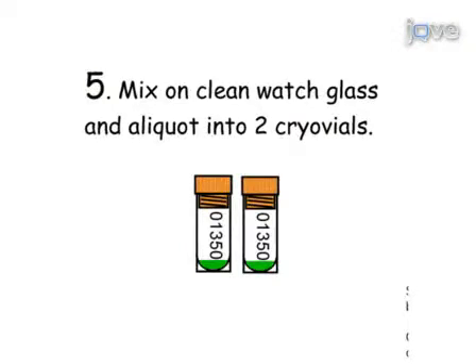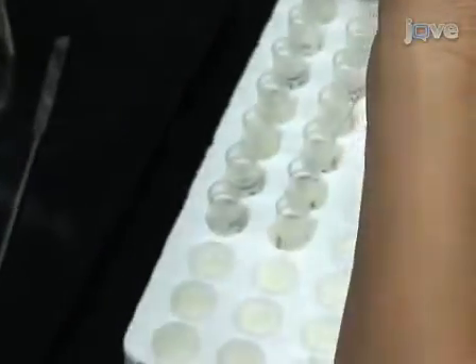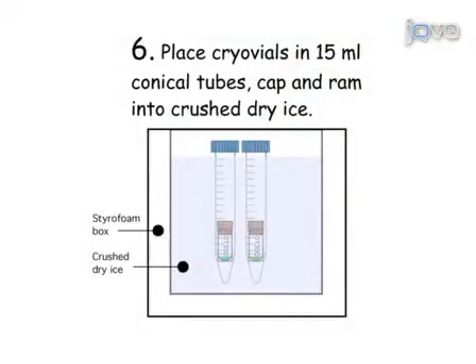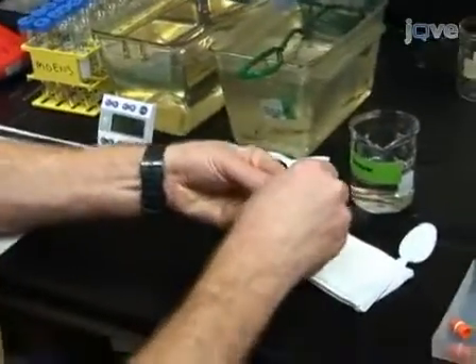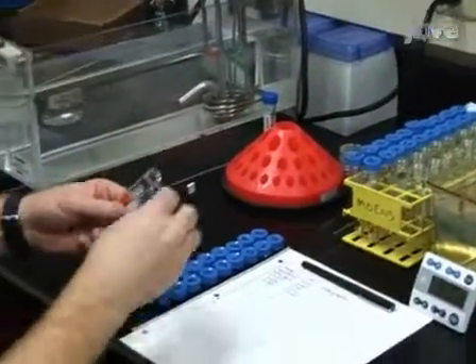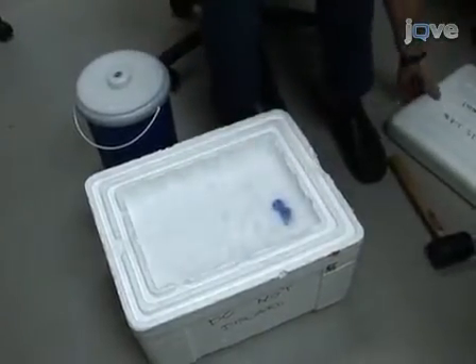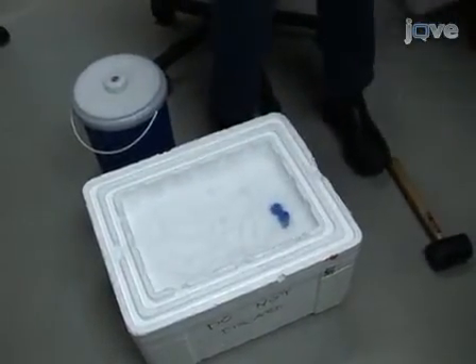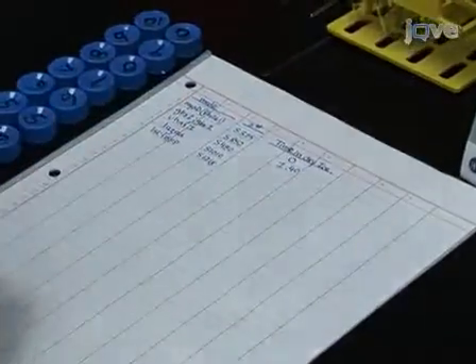Aliquot the sperm into two cryovials by pipetting 10 microliters of the sperm cryoprotectant solution into the bottom of each labeled vial. Moving quickly, cap the vials and drop each cryovial into a separate 15-milliliter falcon tube at room temperature. Cap the falcon tubes and insert them into finely powdered dry ice. The tubes should be inserted deep enough so only the caps show. To keep track of the falcon tubes, number them and record the time that each tube goes into the dry ice. Allow the sperm to freeze in the dry ice for 20 minutes.